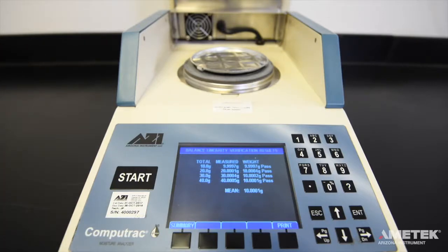If the calibration or verification fails, you will need to try again. If the instrument does not pass after a second or third attempt, refer to the troubleshooting section of the MAX 4000 XL or MAX 4000 manual or contact Ametek Arizona Instrument or your local representative for assistance.